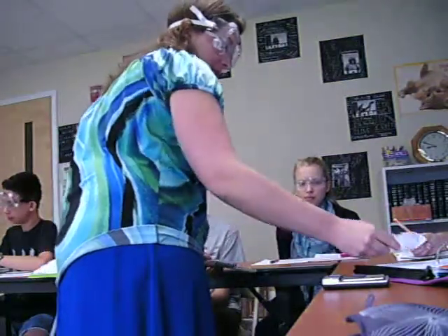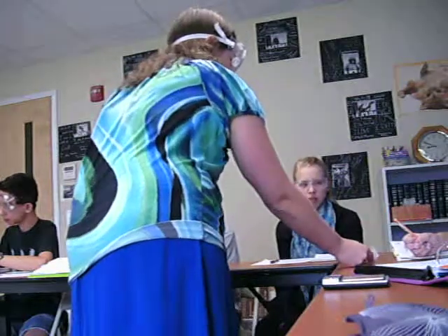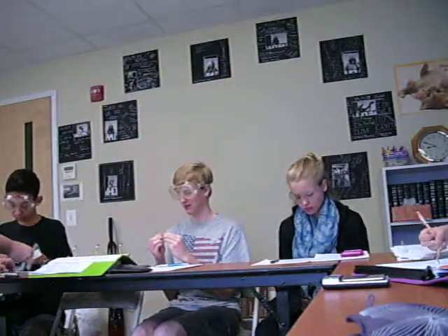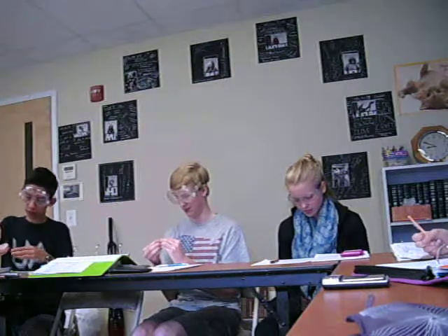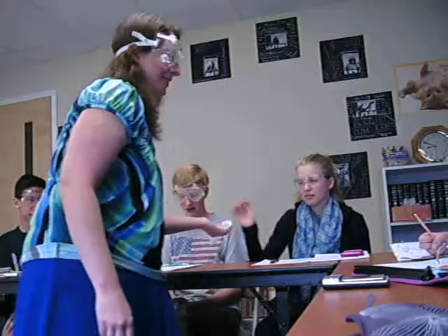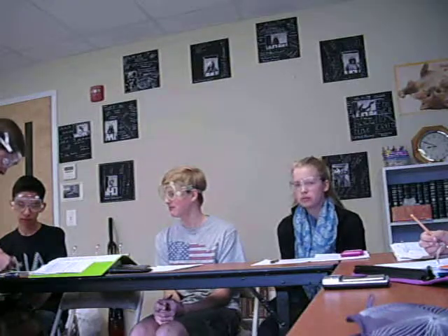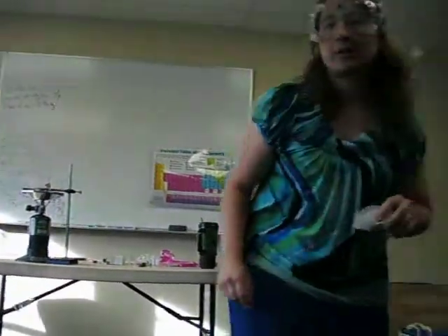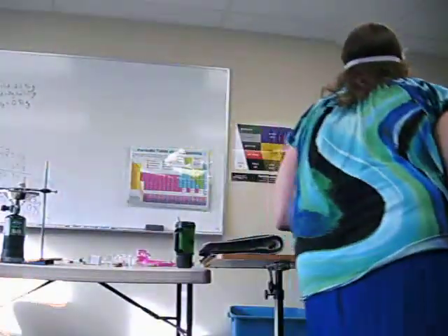And you guys can spit. It doesn't matter what paper you take. You can pick one. We'll just weigh them all together. Okay, nice, the scale is ready. So our mass is chewed up. Did I have everyone's gum? Okay. 7.05 grams. And there is a pile of chewed up gum. Awesome. 7.05 grams.